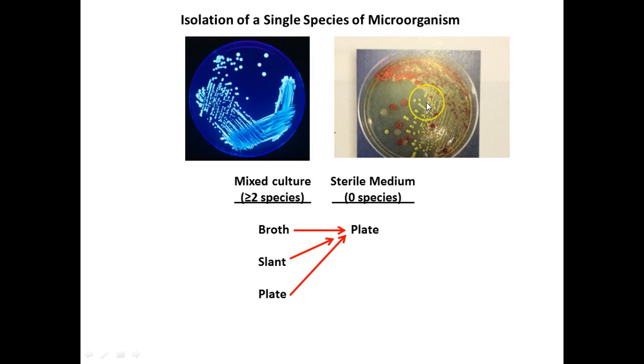Here you can definitely tell they started with a mix. You see different colors. That's a pretty good indication you may have different organisms there. But some organisms will grow differently depending on temperature. So I always know when we lose electricity if I'm growing one of the organisms, because at 37 it's white, and at 25, at room temperature, it's red. So I had polka dotted growth once on my Petri dishes because it started out at 37, and then we lost power over the weekend and it was still cool out so it didn't get really hot in here, and it changed color.